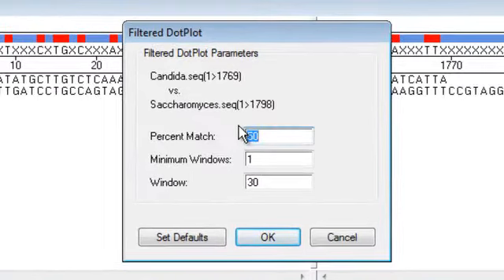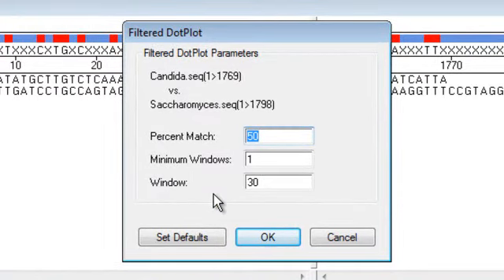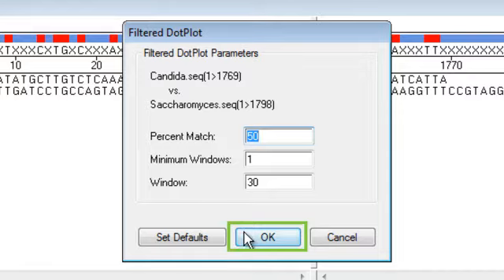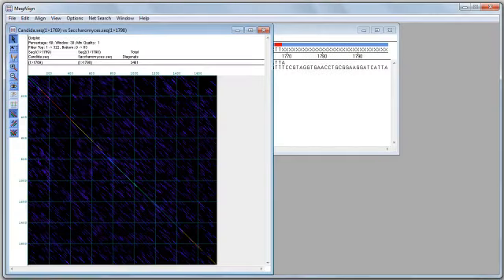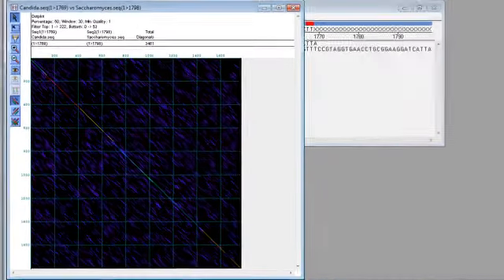The resulting dialog gives me some options to adjust alignment parameters. I'm going to leave these as they are and just click OK. And now the dot plot opens with a graphical view of my alignment.